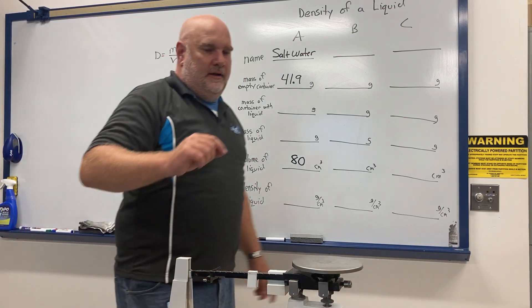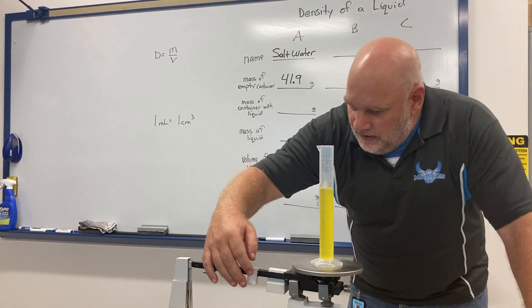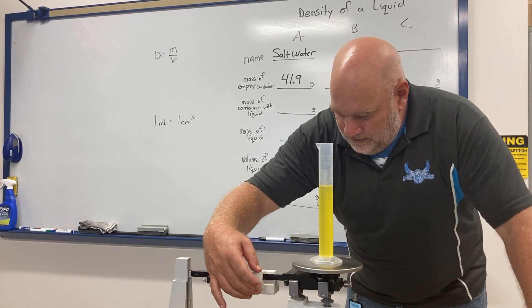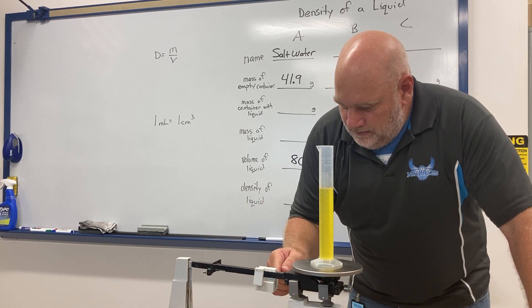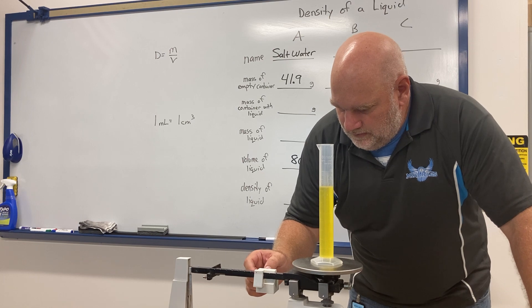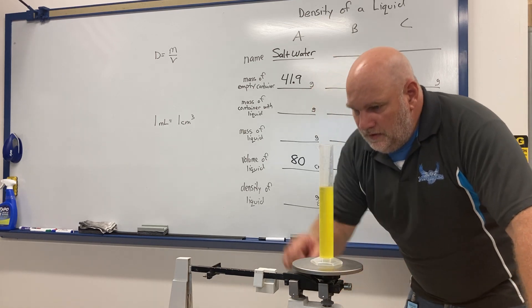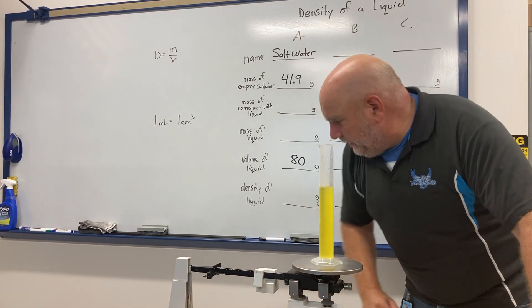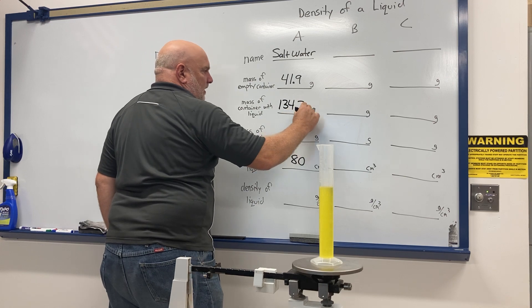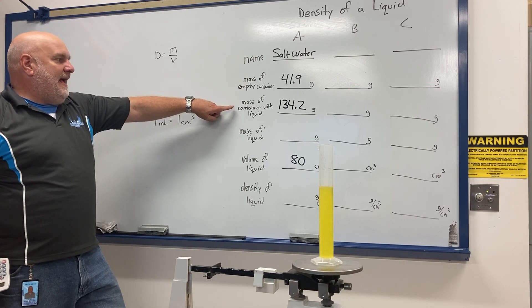Now I put the container with the liquid on the balance to find the mass of the two together. I get 134.2 grams. So that's the mass of the container with the liquid.